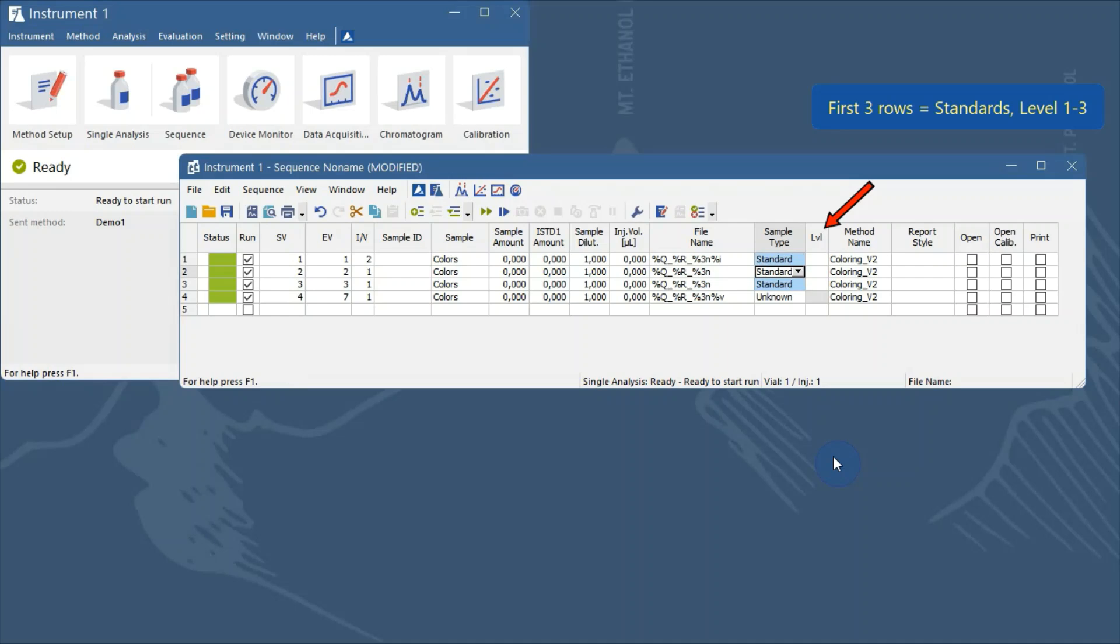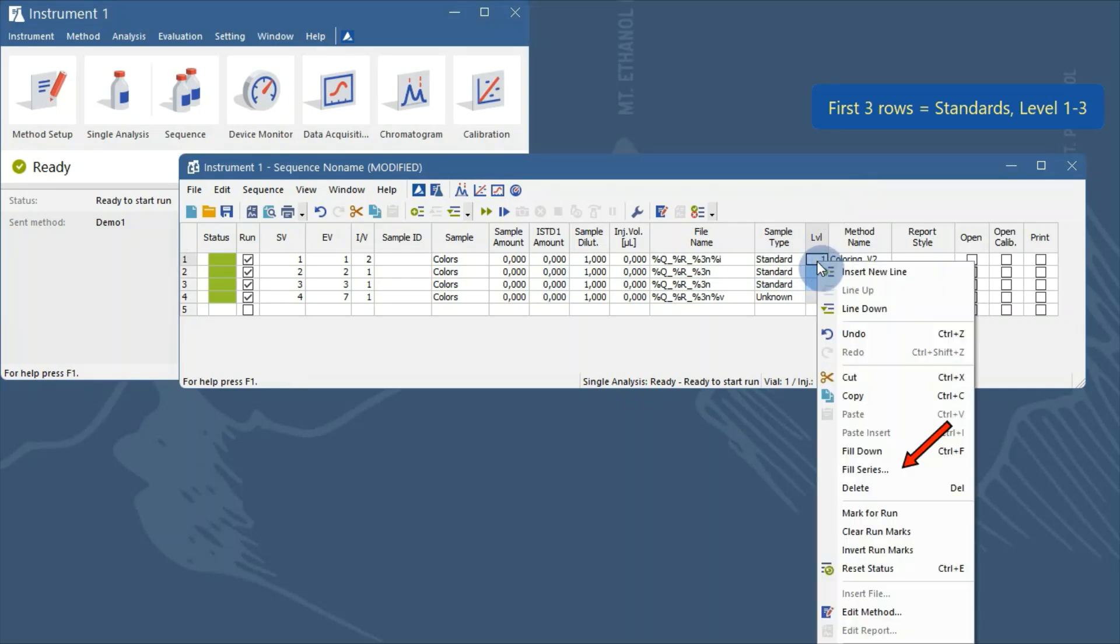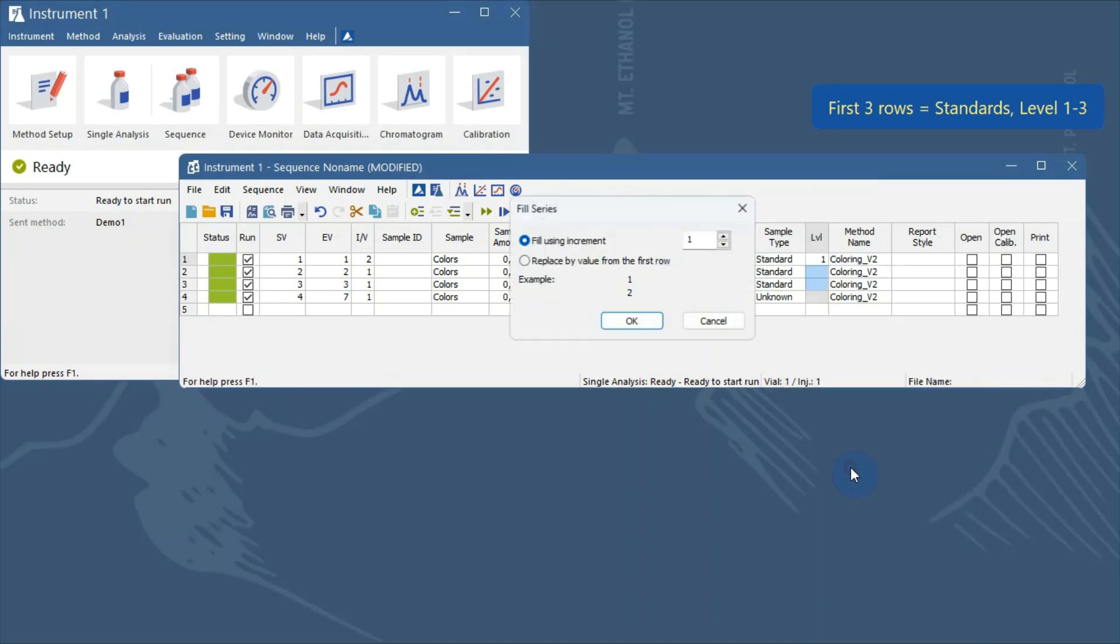Fill in the level of standard as 1 on the first row. Select the level cells on the first 3 rows and select fill series in the local menu. Confirm the dialog that just popped up, we want to increment the value by 1.